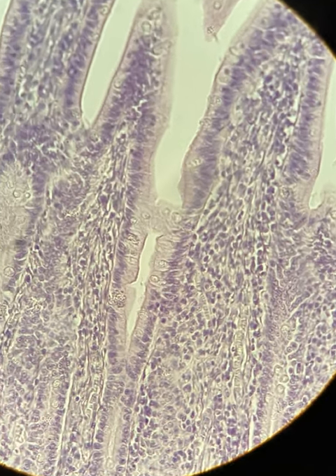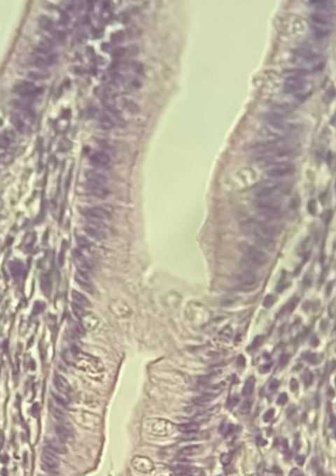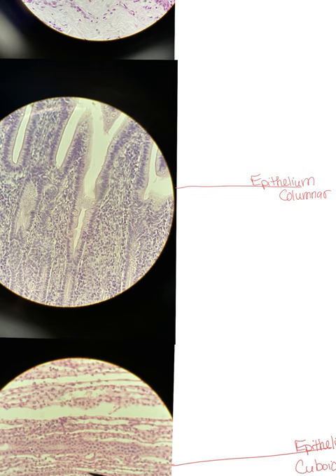Okay, now these guys, remember we were talking about columnar cells. They are rectangular. Remember, we're looking from the white space straight onto what we're looking at here. And you can see that this is not ciliated like the ones that we had before. They're just long rectangular cells. One layer, so we have just a single layer of columnar epithelia. These simple columnar epithelia, so we can just put simple epithelial columnar, they are found a lot in the digestive tract, and they are responsible for absorption and secretion.